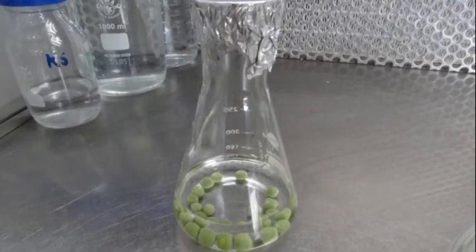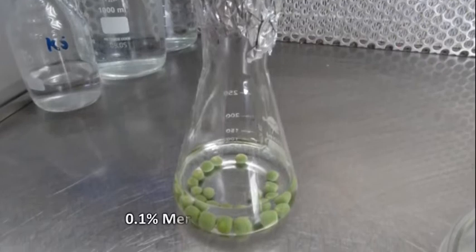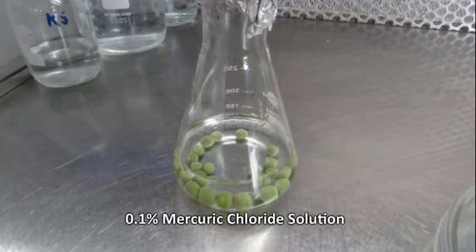Now remove the cap of the container containing the plant materials and pour 0.1% mercuric chloride solution and replace the cap. Wash the plant materials by intermittent shaking for 6 minutes.